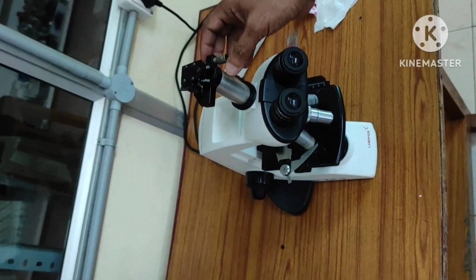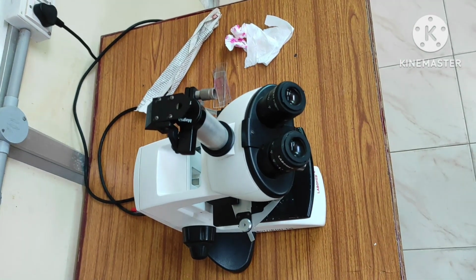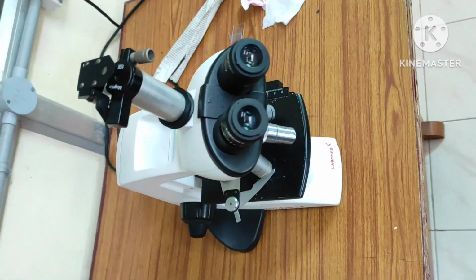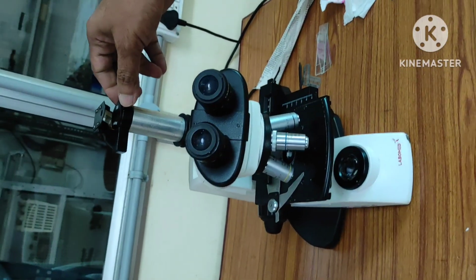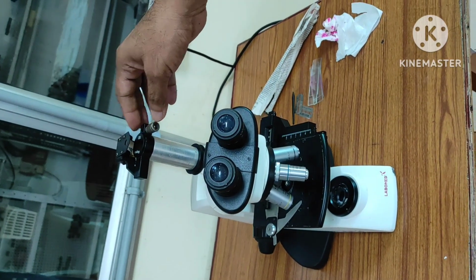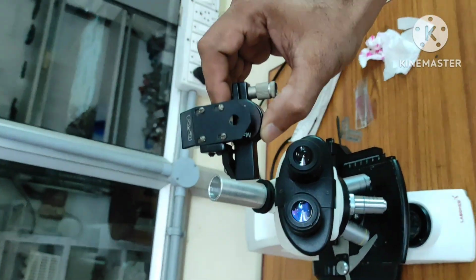That facility camera lucida is providing. With that we can measure the size of the specimens also, even we can measure the thickness of the cell wall, all these things. So micrometry is also part of this only. So camera lucida attached with the compound microscope, right? This is called camera lucida.